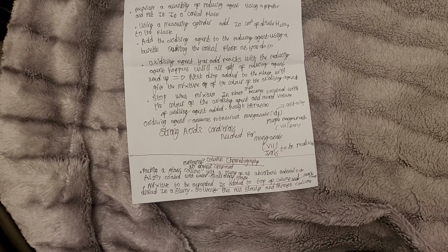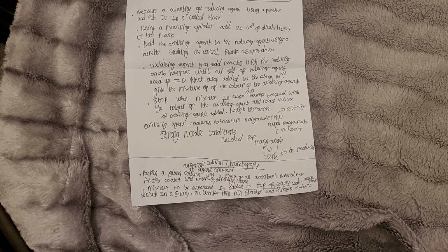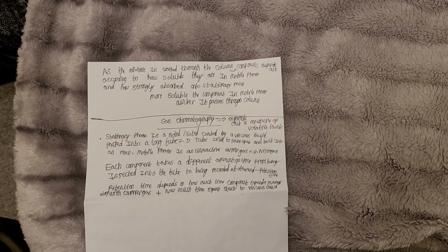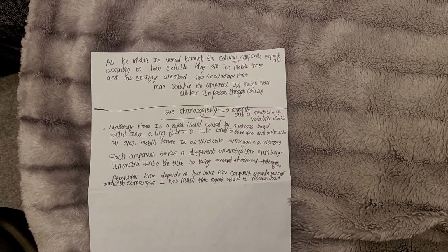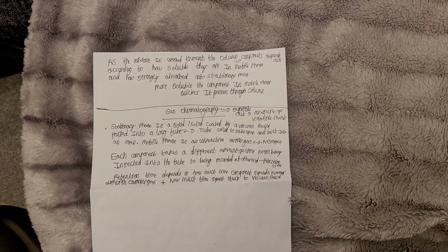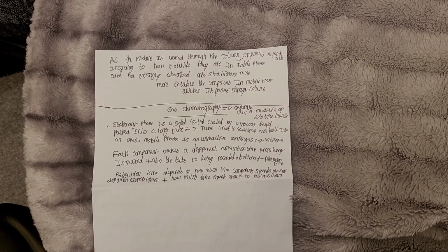And the solvent is then run slowly through the column, and this is the mobile phase. The solvent is the mobile phase. And then as the mixture is washed through the column, the components separate out according to how soluble they are in the mobile phase and how strongly they are absorbed into the stationary phase. The more soluble the component is in the mobile phase, the quicker it passes through the column.